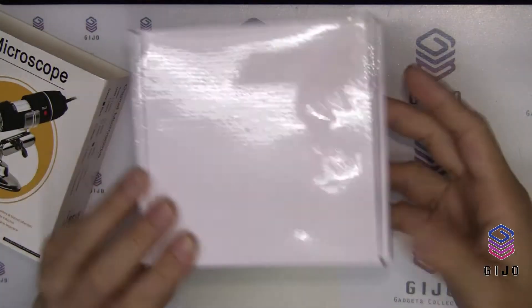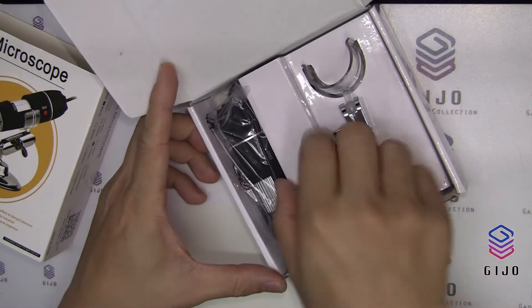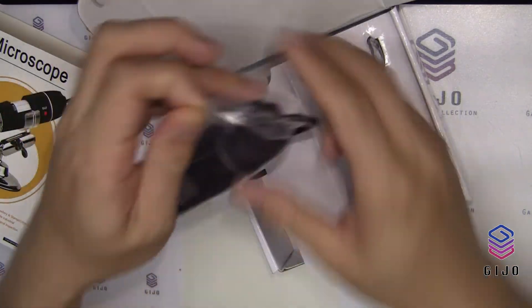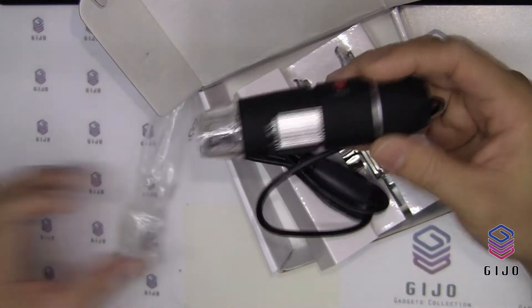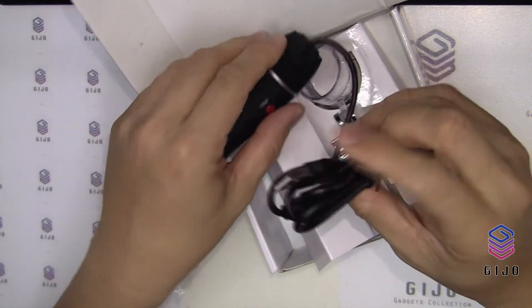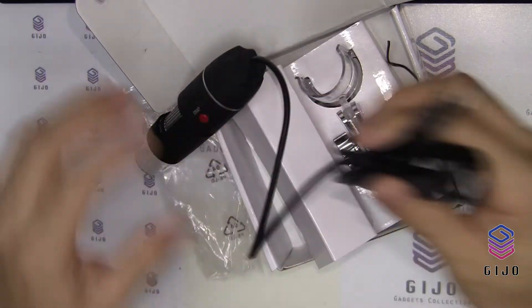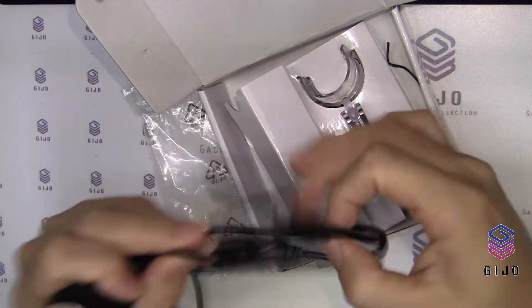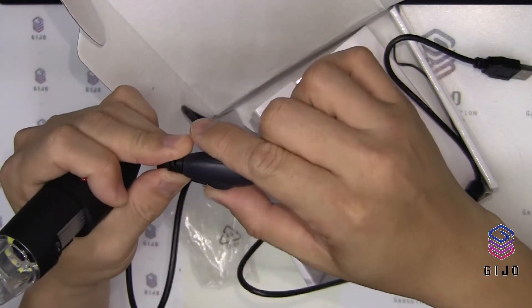So let's unbox it. It looks like a webcam, where it has a USB port you can attach to your computer. The cable provided is quite long, about one meter. And I wonder what this is — must be the volume control.